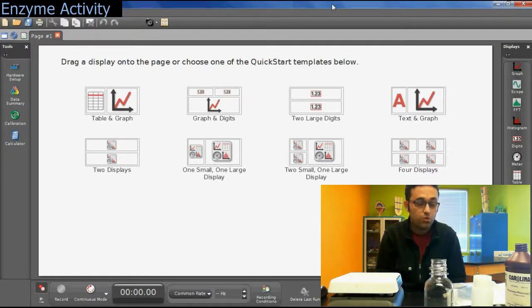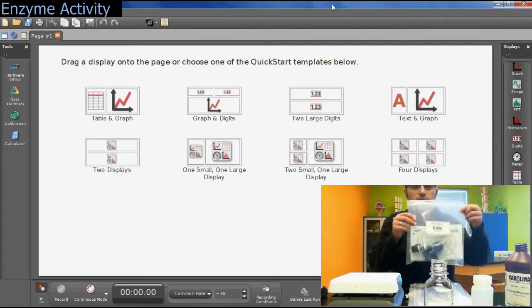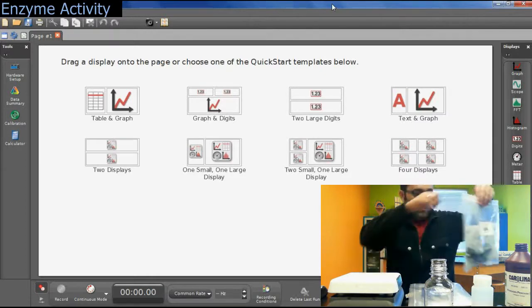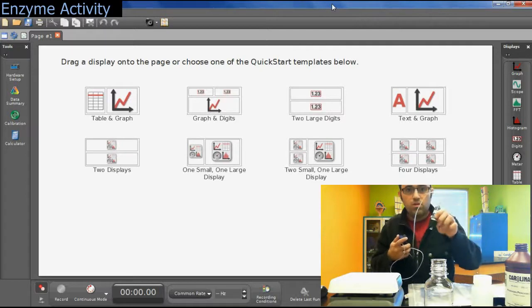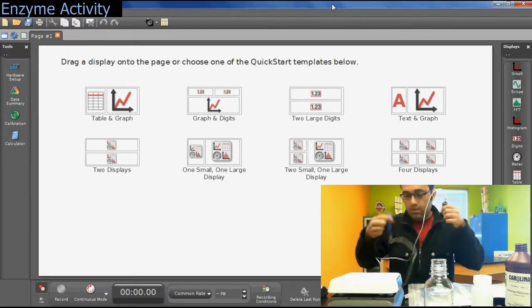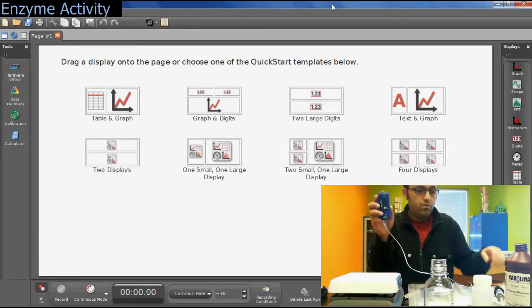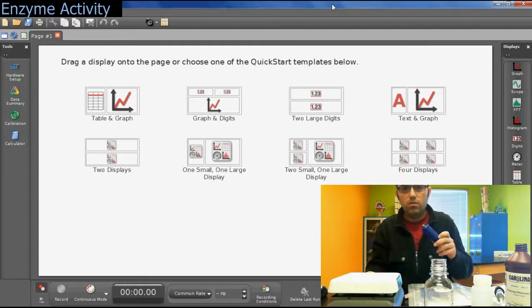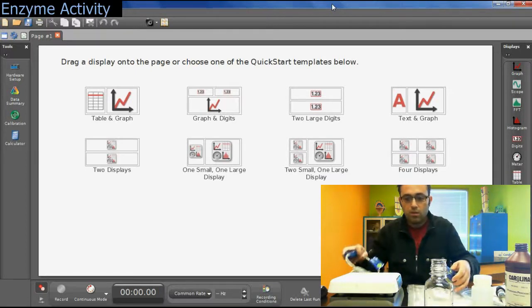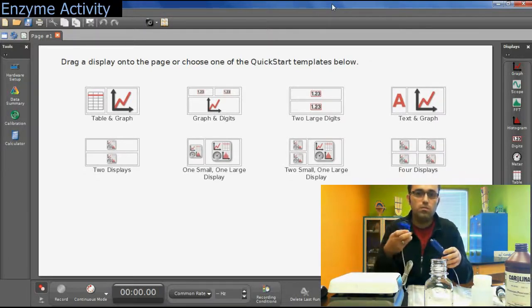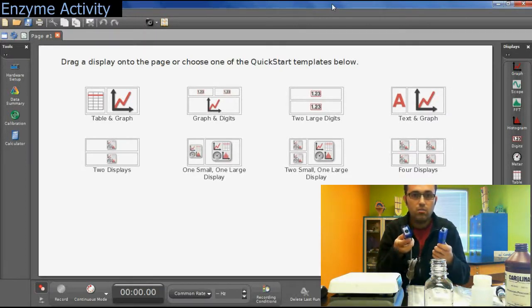You're going to use oxygen sensors — we're going to use PASCO sensors. Here is the oxygen sensor in this plastic bag with a label. You're going to remove it from the plastic bag. This is the oxygen sensor itself with a rubber stopper on its top. You will need a USB link interface to connect this into your laptop, since the data collection software runs on your laptop.